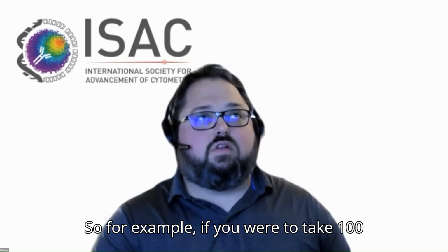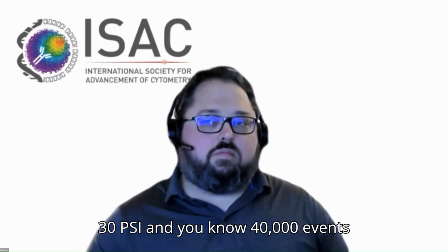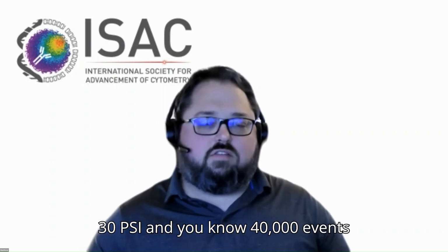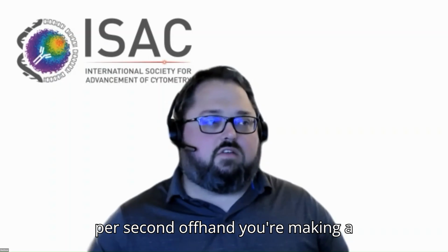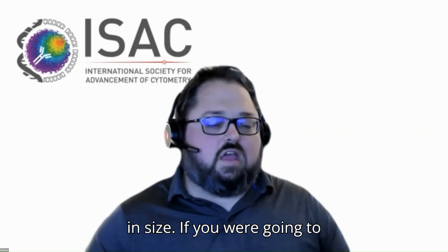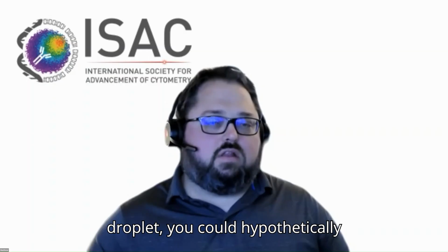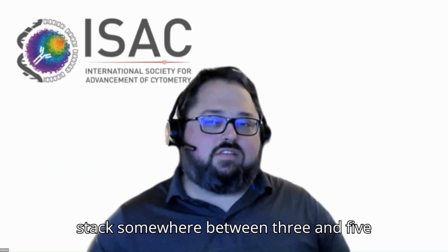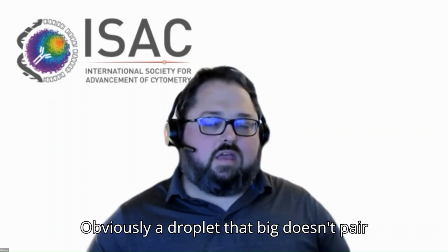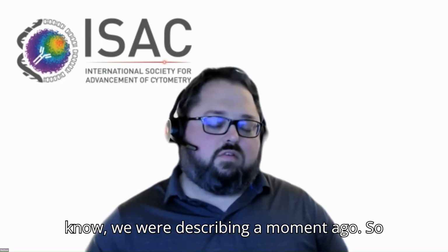So, for example, if you were to take a 100 micron nozzle at, let's say, 30 psi and 40,000 events per second, offhand, you're making a droplet that's about 3 to 3.3 nanoliters in size. If you were going to stack lymphocytes inside of that droplet, you could hypothetically stack somewhere between 3 and 5 end on end if they were touching, right? Obviously, a droplet that big doesn't pair well with the kind of speed that we were describing a moment ago.